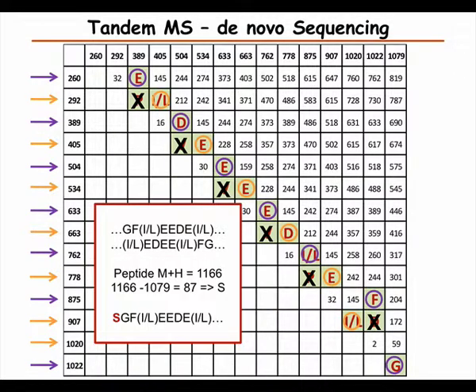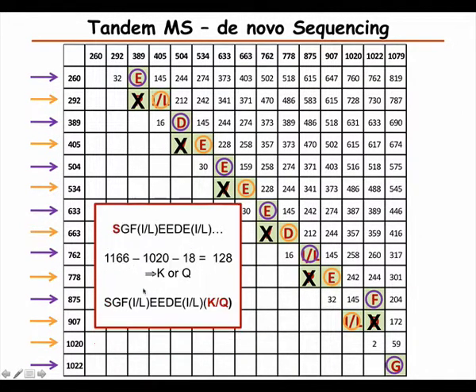So what we can do is look at the full peptide mass. We have the difference between this one ion, the 1079 here, which is at the end after this G. We see that to get to the full peptide mass from there, we have a serine. So now we know the direction, that this is the N-terminus. And then we can confirm it and get the last amino acid from the mass. But here now we know that this is a Y ion, so we subtract 18.